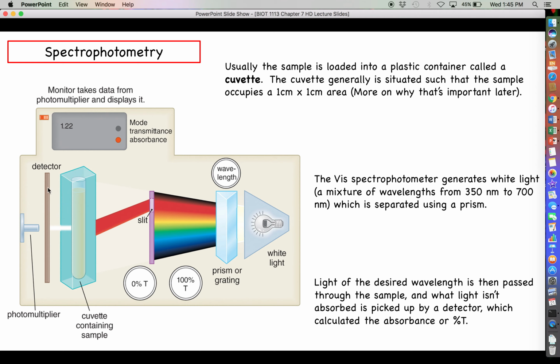Well, if we back up here a second and look at the visible light spectrum, what are we looking at between 400 and 500? We're looking at the blue colors. So, of course, that explains why Coomassie appears blue to us. It is not absorbing blue colors. It is instead reflecting them back at our eyes. Let's look at another example here.